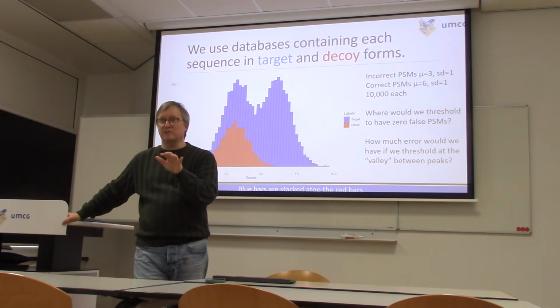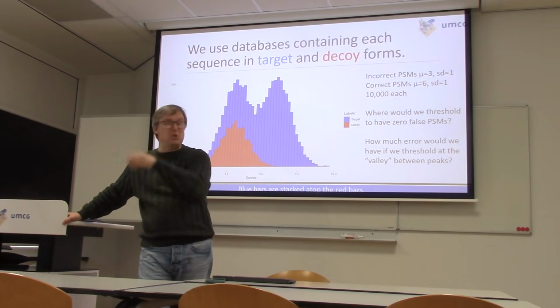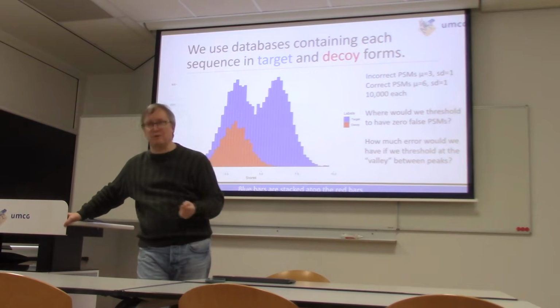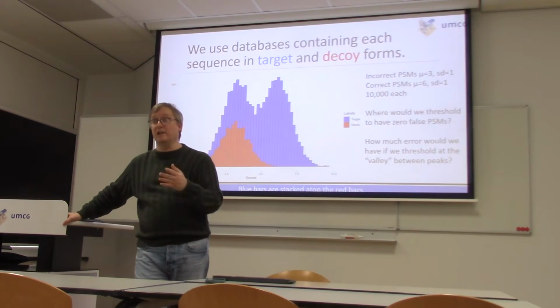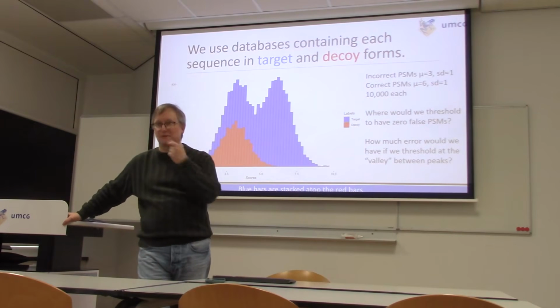Any MS has some predilection for matching to a random sequence. Most of the tandem mass spectra we collect have, say, 200 peaks in them. And even the correct answer is not going to explain all 200 peaks. Hopefully it'll explain the big ones, but there will be plenty of background noise that will be left unexplained.